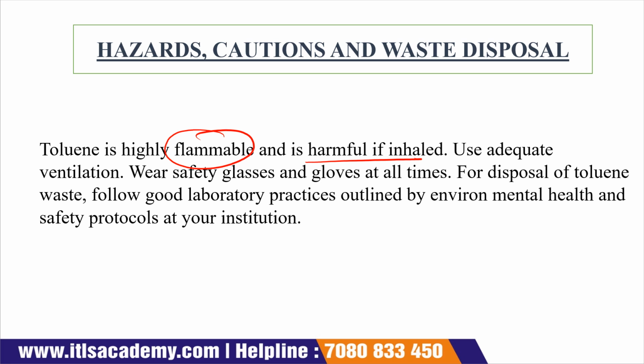We also have to wear glasses and gloves, and all the waste generated by the toluene is to be disposed of separately, and along with that we have to follow all types of good laboratory practices which come under the category of environmental health and safety protocol, and we also have to follow the safety protocol given by our institute.